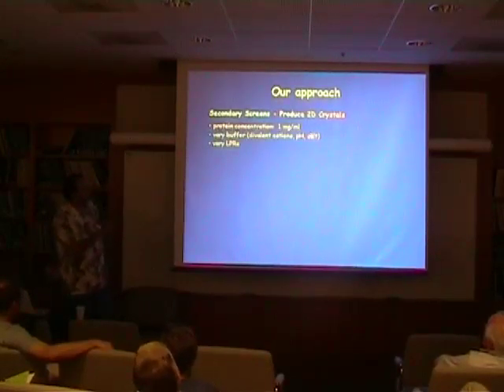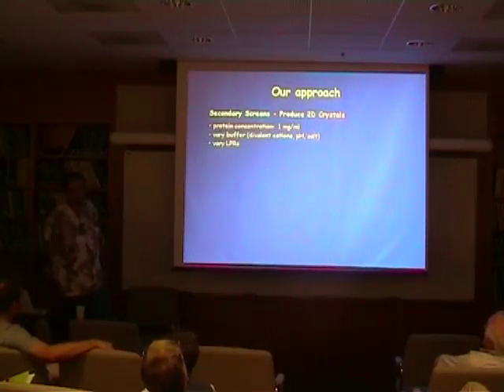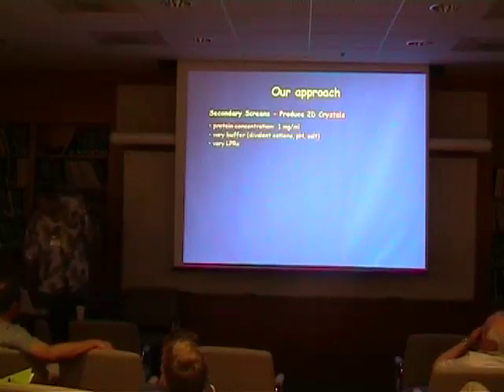And so the protein concentration we don't change, it's still the same, but now we vary a lot of the buffer, different buffer constituents, divalent cations, all this stuff. And then we also start to vary the LPRs a little bit more around where we think it's useful. And what I find is that a lot of the proteins actually crystallize at an LPR around 0.5. So that seems to be a good LPR.